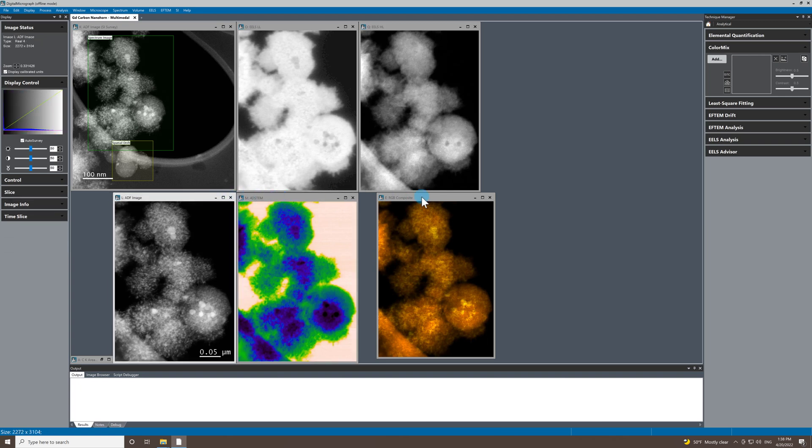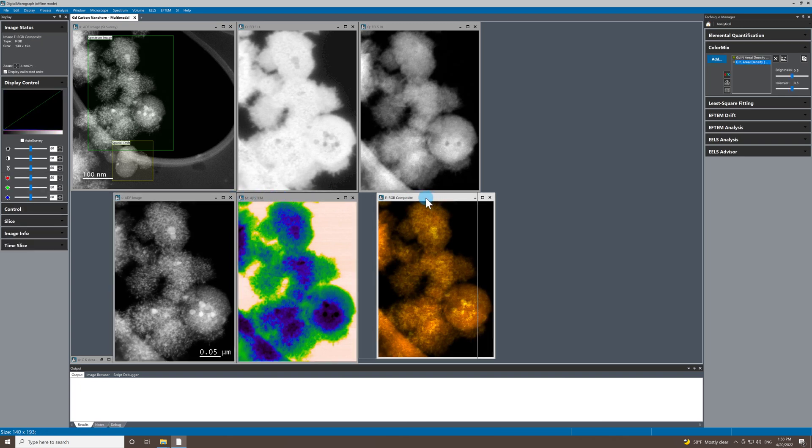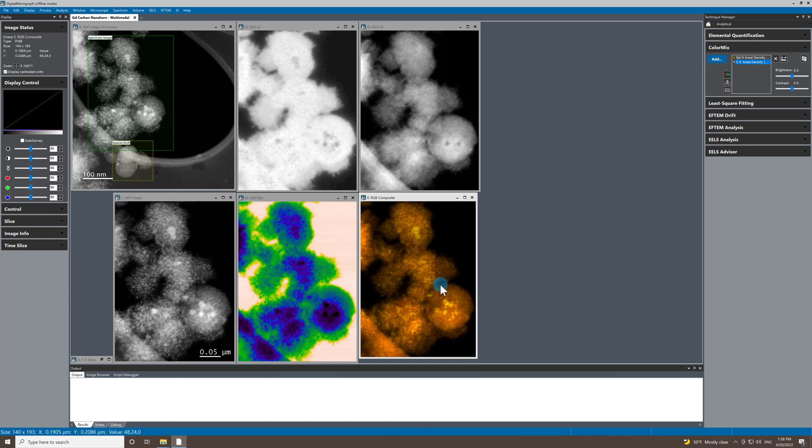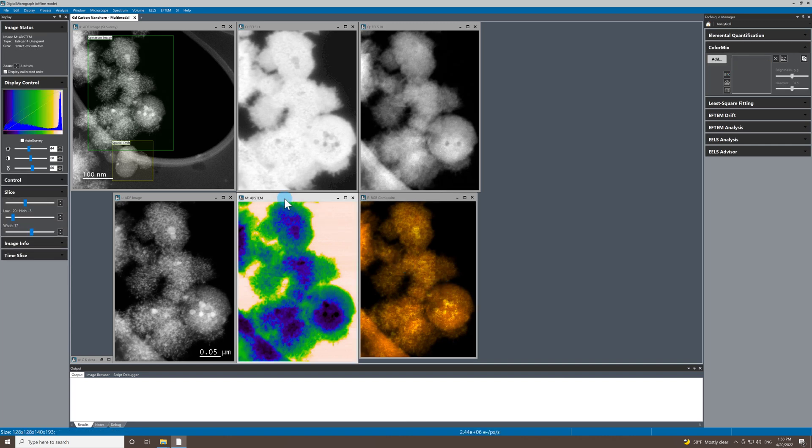Okay. So this is a multimodal experiment. So what's the point in what I'm doing here? It's really nice because basically we can correlate features that we see in our chemical map or our chemical data with information that we have in the diffraction dataset.